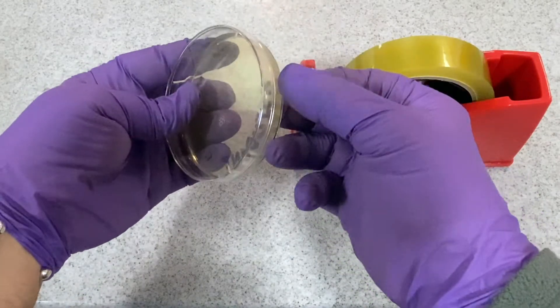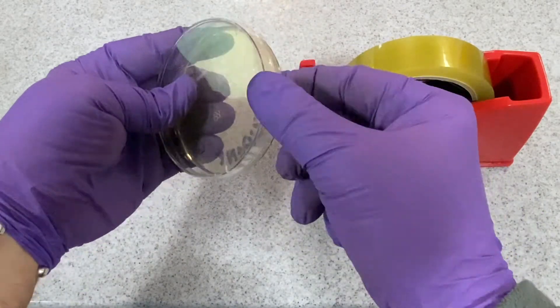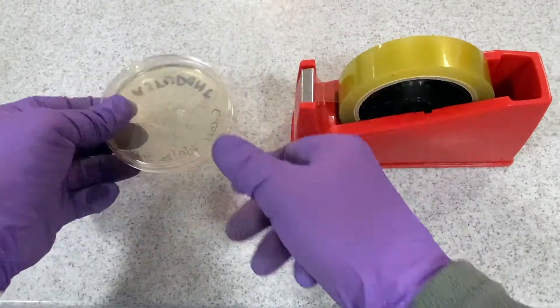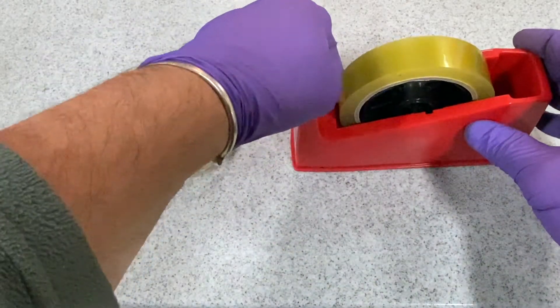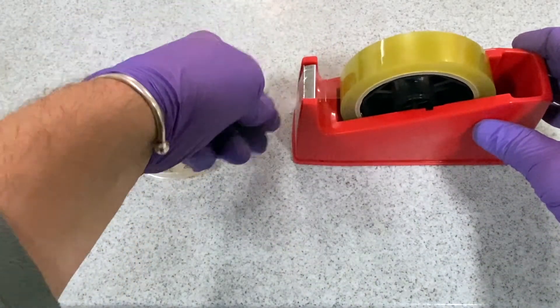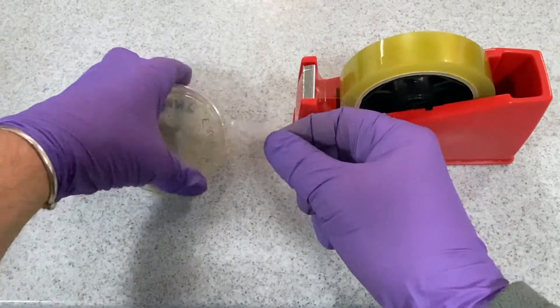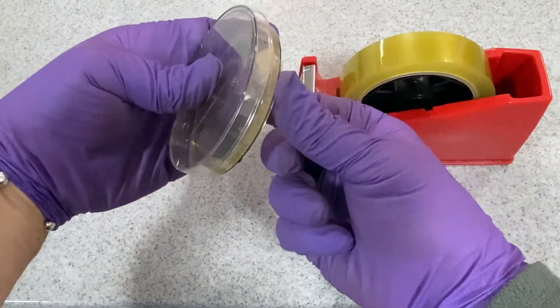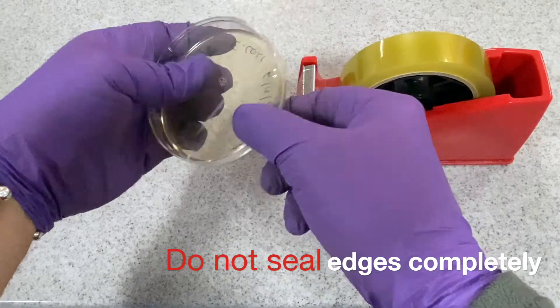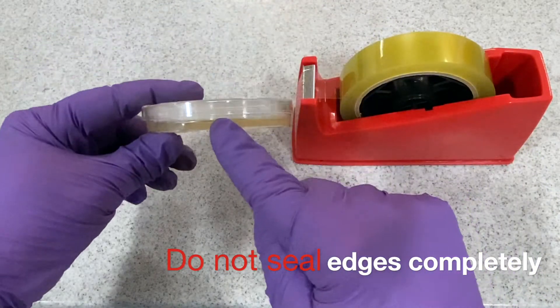The petri dish lid is secured above the sample by means of sellotape. Use two or three pieces to secure the lid to the base of the dish. Never seal completely around the edge of the dish as this will create anaerobic conditions and may allow for the growth of harmful bacteria.